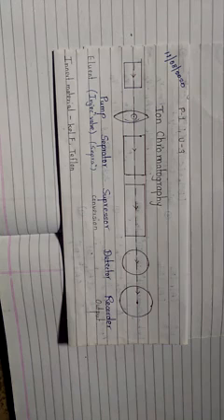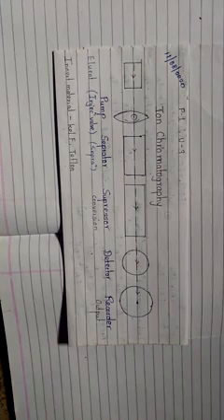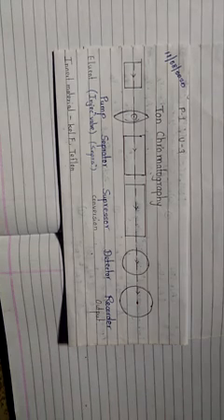Next one, it is used for analysis of sugar and amino acid. It is used in chemical industry also for analysis of impurities, and agriculture product analysis, and also for analysis of micronutrients in soil. Thank you.